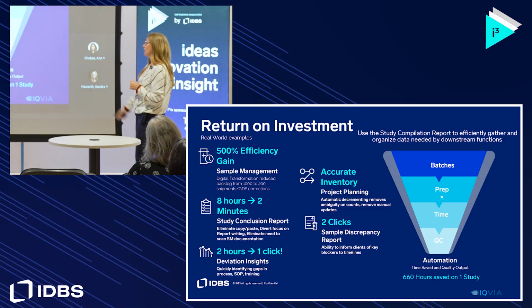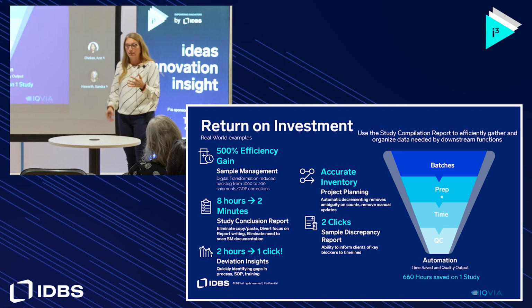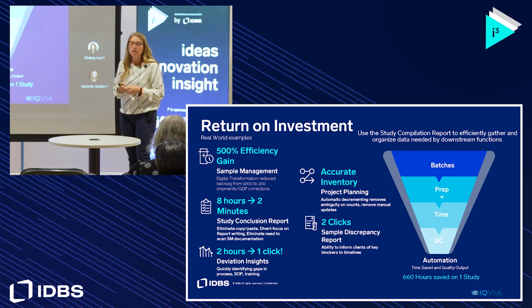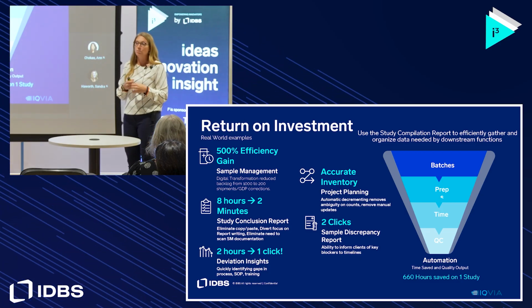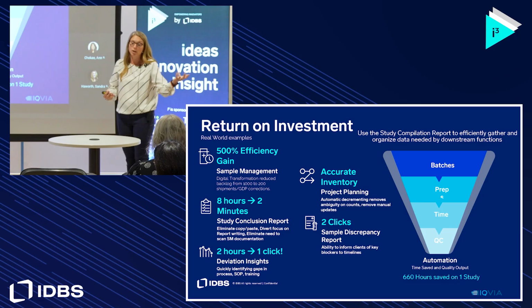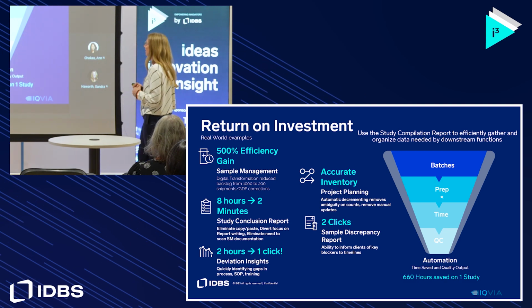Another example was the sample discrepancy report. A client came to sample management and said, why haven't you analyzed these samples? And they said, well, there are outstanding discrepancies. And the client said, well, what are they? Maybe we can help if the clinic's not replying. So they just ran this report, exported it to Excel, and sent it to the client. It was such a better way for clients to understand what their partner is actually having to deal with when you're working with all these different clinics. And they were able to help get their samples through faster by helping answer the questions. So that was really great.